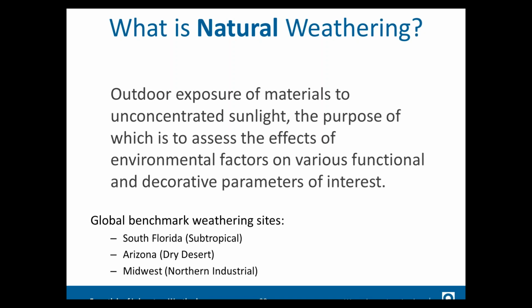South Florida is a global benchmark for subtropical, which means it's high irradiance, high heat, high moisture. Arizona is a benchmark site for dry desert, which means it's very high irradiance, very high heat, low moisture, and significant temperature shift from day to night. And then Midwest, Northern Industrial is a place where you're going to experience both UV and moisture, but you're also going to have some freezing and some pollution effect on the natural exposure.